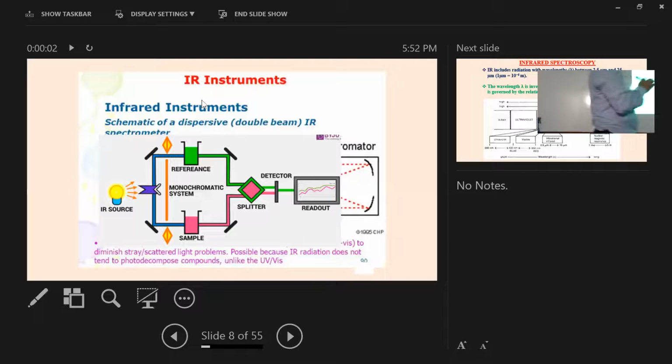Normally, it should not absorb the light until we reach these three different wavelengths or wave numbers. So, normally, what types of spectrum should we have? We are detecting both the lights at the same time.